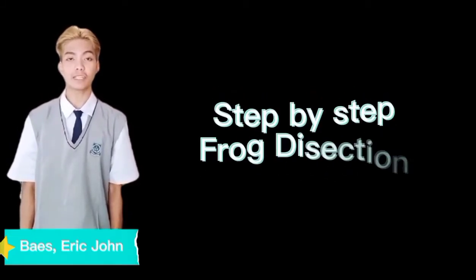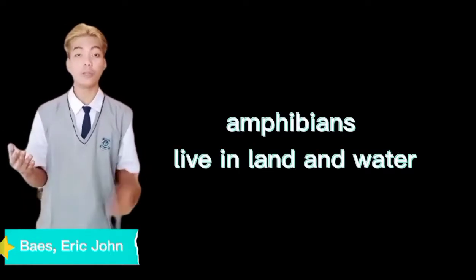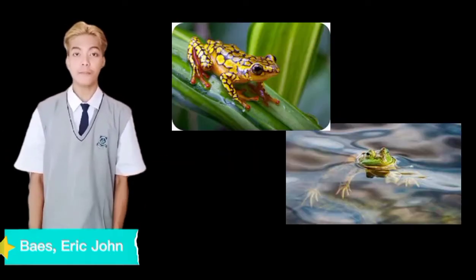Today, we are going to show you a step-by-step frog dissection. Yes, frog dissection. Frogs are the animals that belong to the class Amphibia, commonly known as amphibians. Amphibians both live on land and in water. Sometimes they live in water only before they are fully grown.